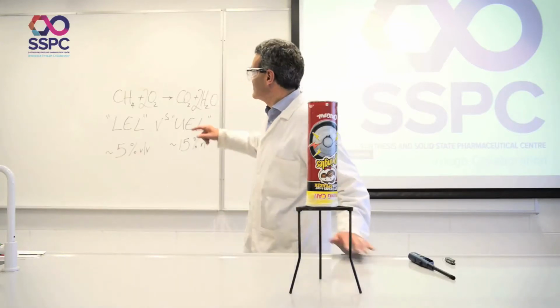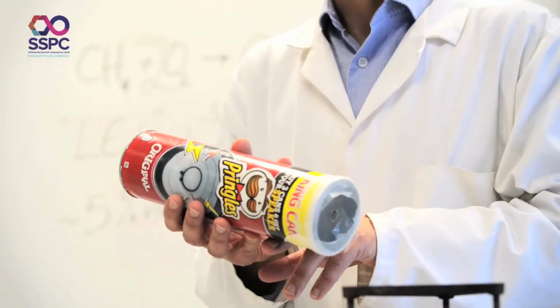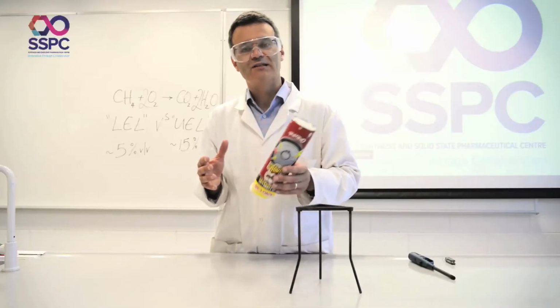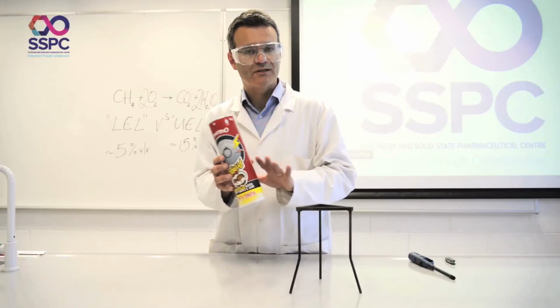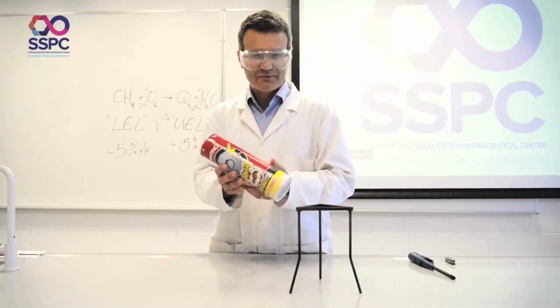So what I have here inside the tube is some methane, and I filled that from the normal lab supply that you'd have for a Bunsen burner. Now it must be methane that you have, not propane or butane. You need methane because it's lighter than air, and you'll see why when I work through the demonstration. So it must be methane, not propane, not butane. Very important with that.